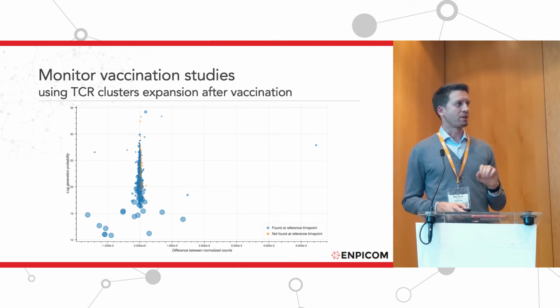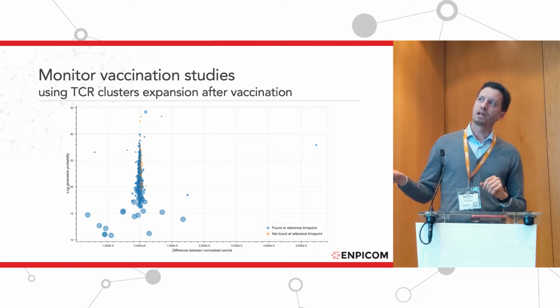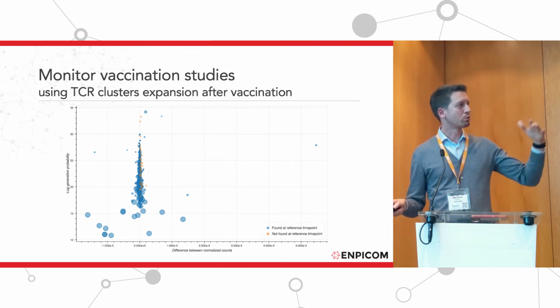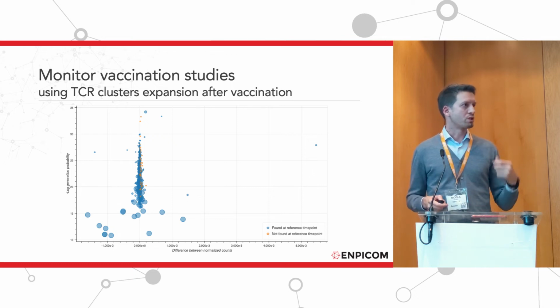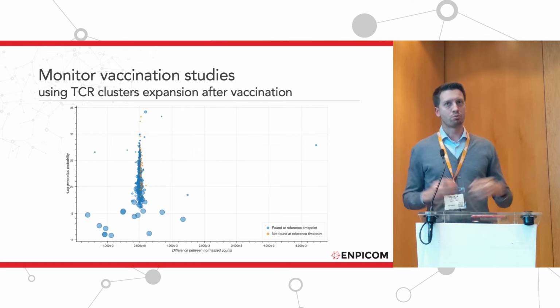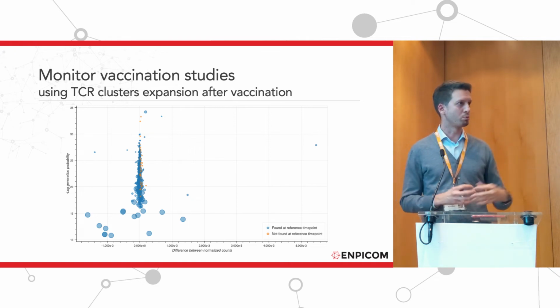Now, an interesting aspect that you can already observe by looking at this plot is that most of the large circles, and I remind you, large means found in multiple patients, are towards the bottom part of the plot, which is congruent with the idea that those are sequences which are more likely to be found randomly. Because if a specifically recombined sequence is more likely to be found randomly, therefore it is more likely to be found in multiple patients, so to be public.